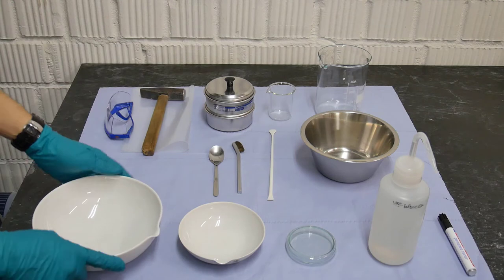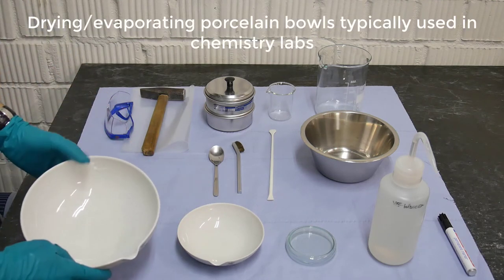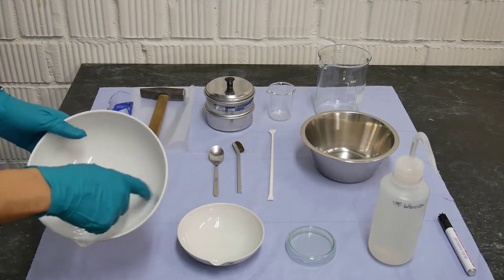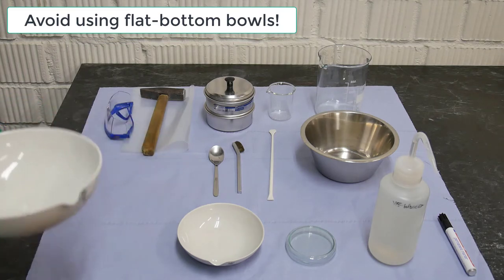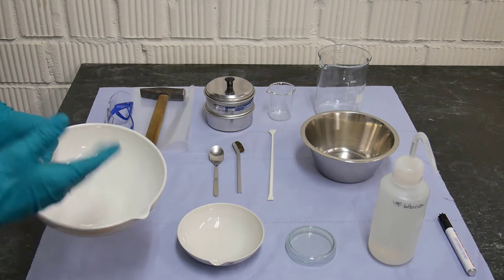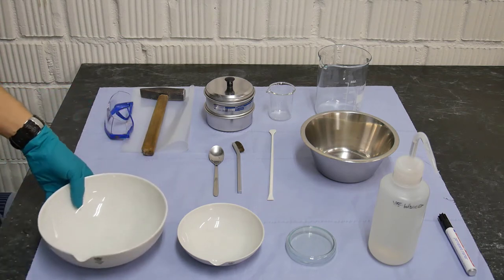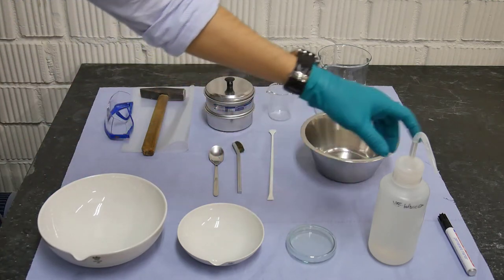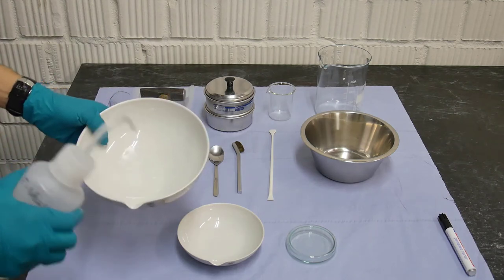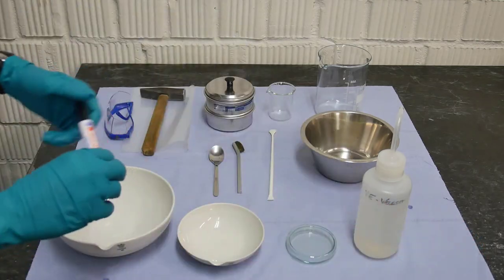We also need bowls — two different bowls. Be careful to get bowls that are curved at the bottom and not flat, because if you only have flat bottom bowls the process of separation won't work very well. We also need a petri dish and a bottle of water that you can squeeze. And of course, we need a marker.